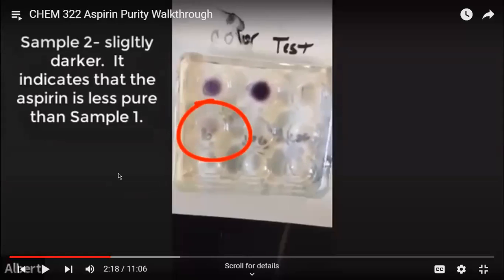So if you're using sample 2 and you're filling in your data sheet based on sample 2, this is what you would put in that iron chloride testing table, right? You would put that it is still faint, so still faint purple. Is it within limits? Yes. This is also a very clean sample, but you can see compared to sample 1, which is up here, it's a lot more purple. So it's not as clean as sample 1, but it would still be considered a clean sample.